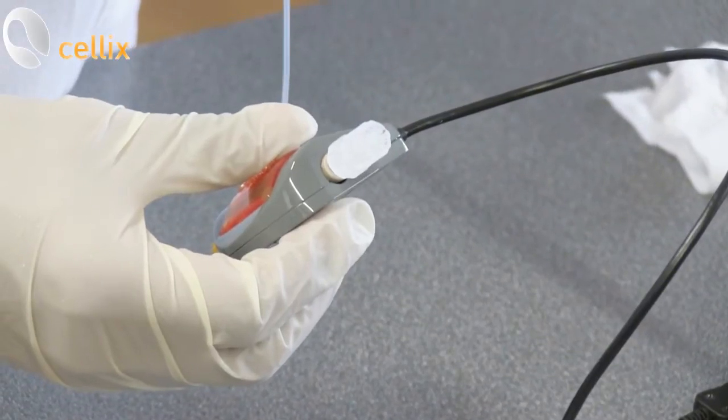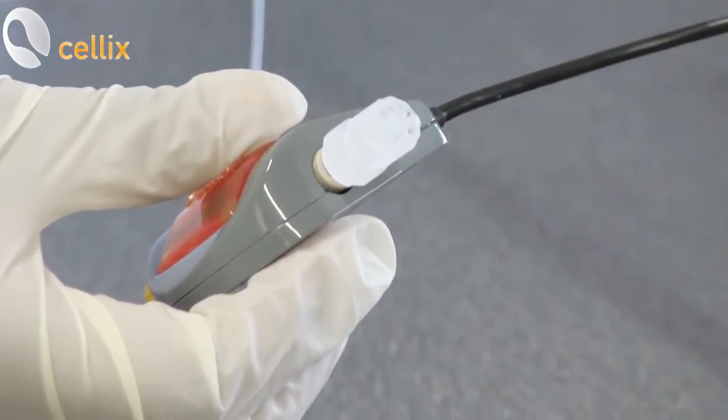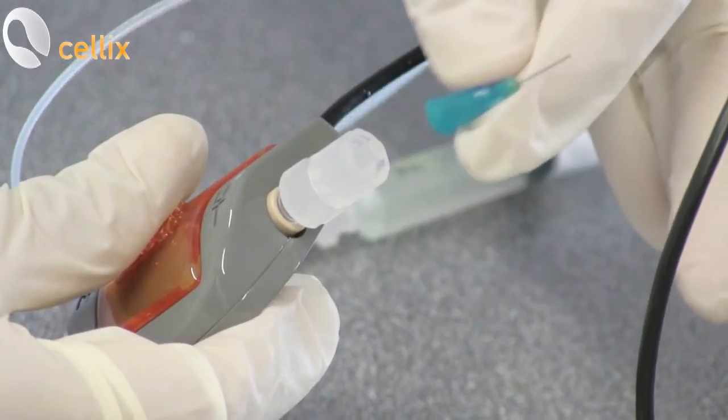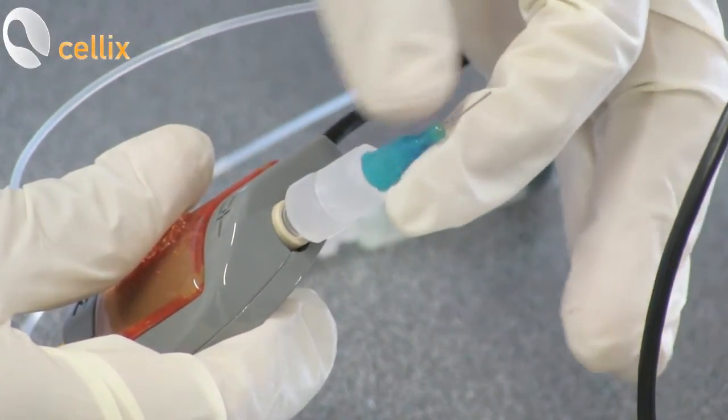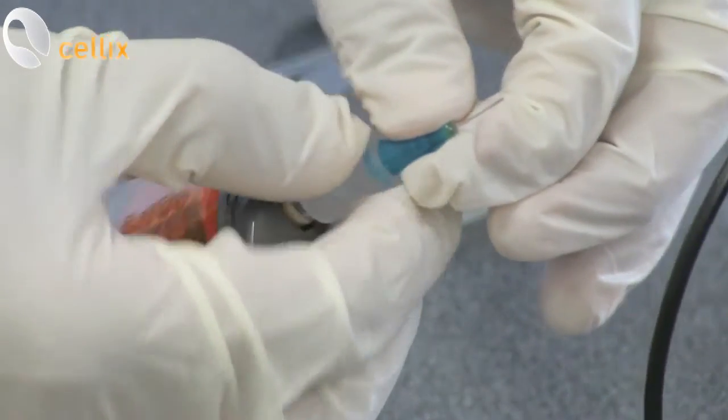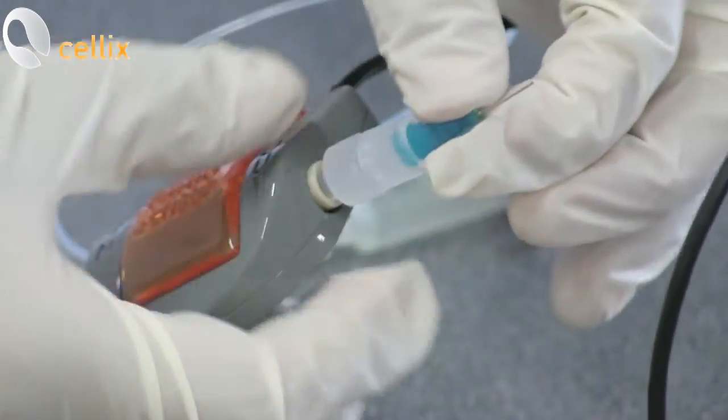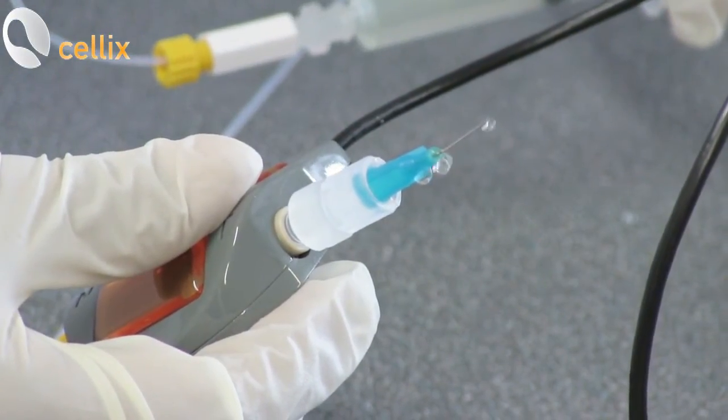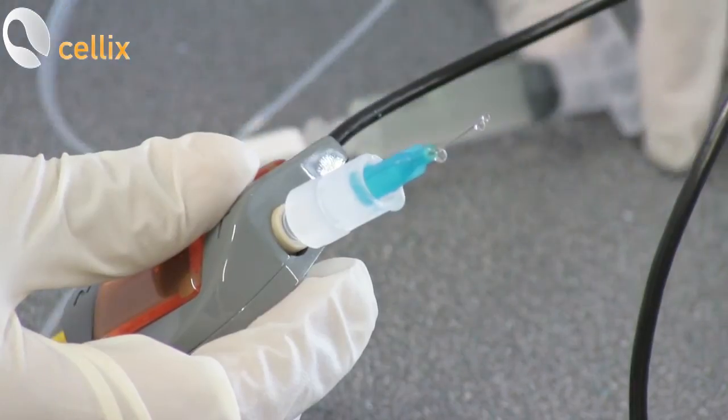With the syringe, just infuse some liquid to remove the bubbles. So you take this blue connector, connect it to the output, tighten it, and infuse some liquid to remove the bubbles.